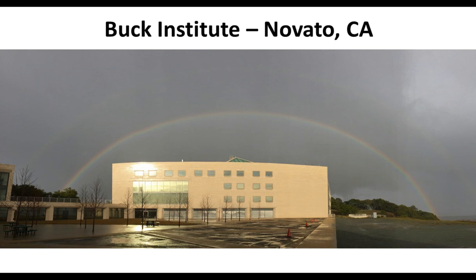We haven't done this for the phosphorylation yet, although I have to say in the past, other groups have done this kind of work, combining phosphoenrichment methods. So I actually do think that this is equally possible, and it might even be interesting to try and see if one can combine different classes of PTMs. I think there's a lot of space to explore these things and really look at PTM crosstalk and dynamics in particular.